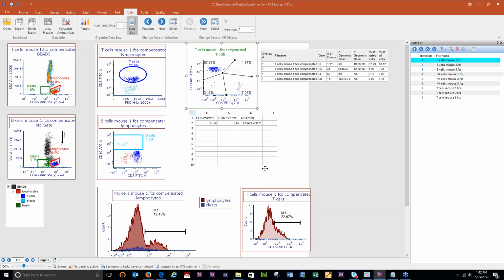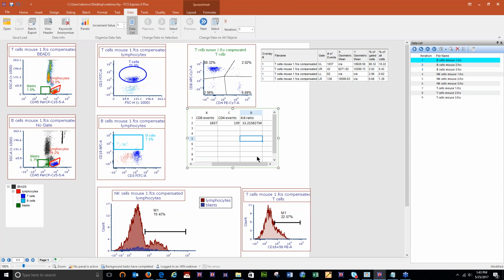Okay, great. So let me show you one other cool thing. The way to move the quadrants, there was one question coming in. You can just hover your mouse over any one of the individual vertices, and then you'll be able to move that vertex.